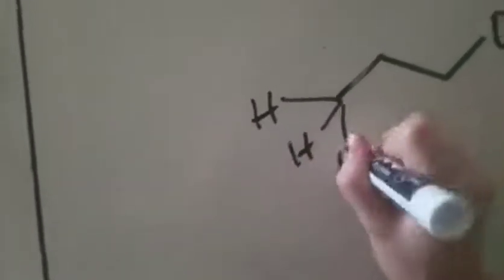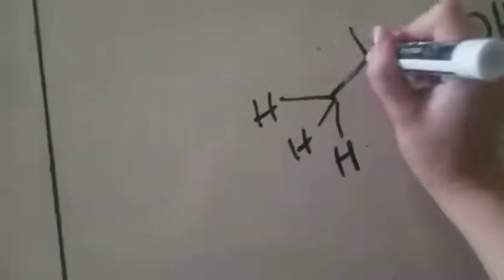Okay, so the first thing I recommend you guys do is to go ahead and just label all of your protons. Just do it. So I know this has 3 protons here, right? It's a CH3. I know this one has 2 protons, right?